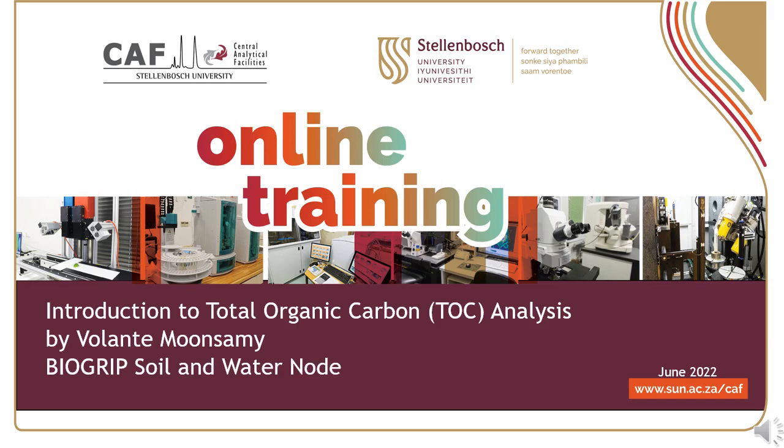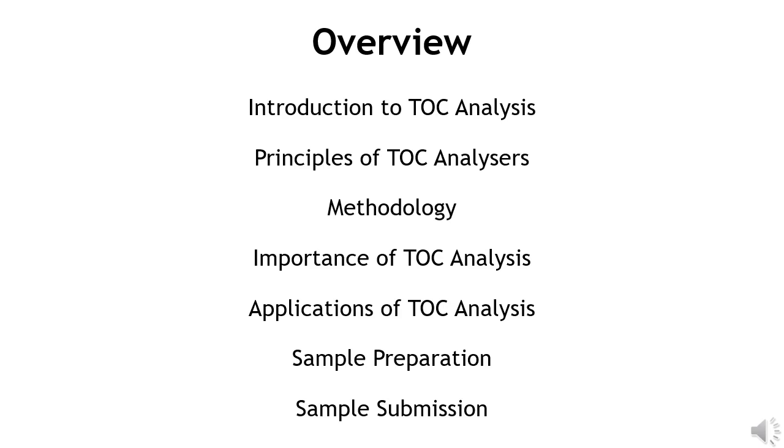Today, our presenter Volante Moonsamy will be giving a talk on the introduction to total organic carbon analysis. The workshop will cover the following topics: an introduction to TOC analysis, the principles of TOC analyzers, methodology of TOC analysis, importance of TOC analyzers, applications of TOC analyzers, sample preparation involved in TOC analysis, and how to submit your samples for TOC analysis.